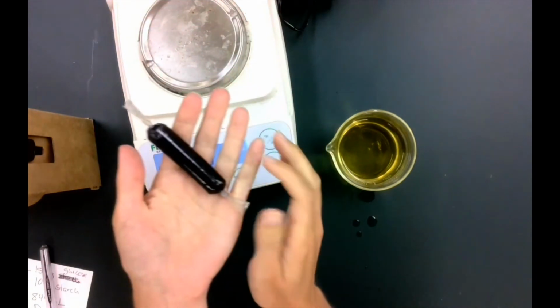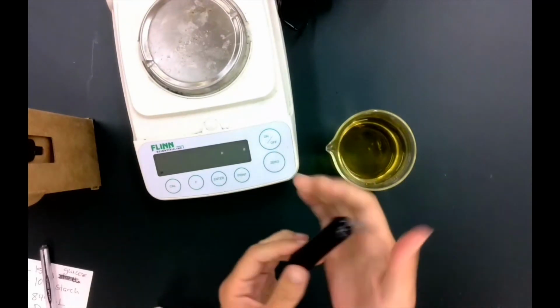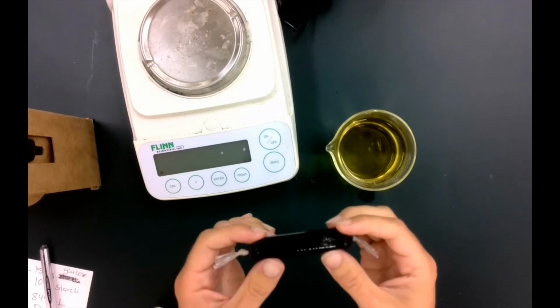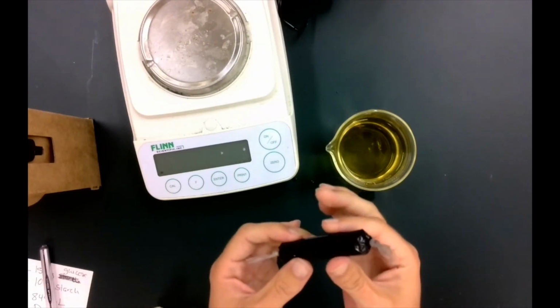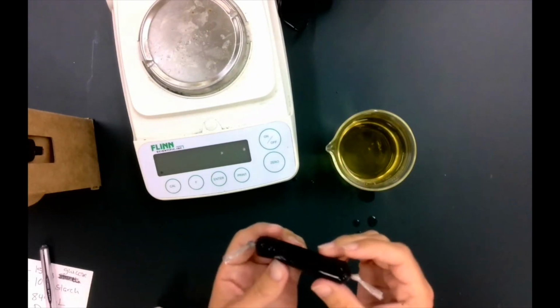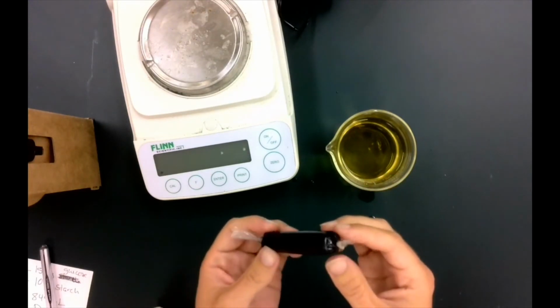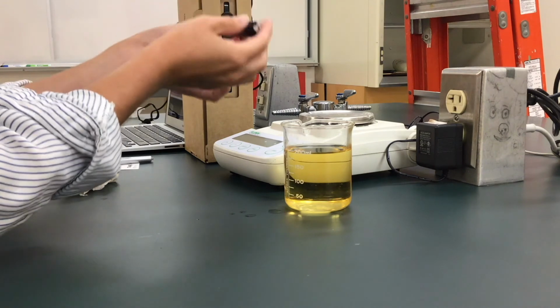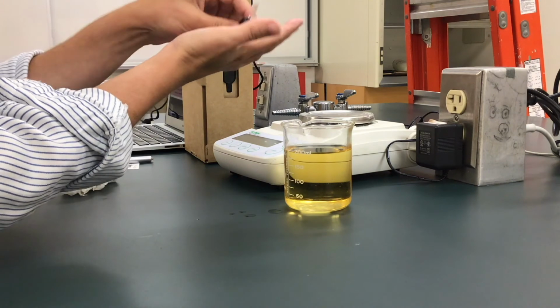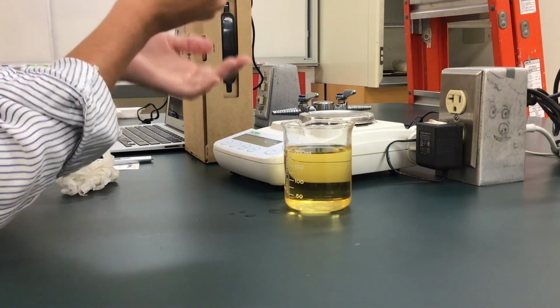and that's unsurprising to me because of the change in the bag. Now, what is the other important thing that we notice here? We have greatly increased the volume of the bag, so it's more turgid, and we have changed the color. Remember, our initial color was almost whitish, and now we see blue. And what did we say was a possible blue indicator in this? The Lugol solution. And so that means the Lugol solution has somehow entered the dialysis tubing bag and interacted with the starch material on the inside and made it blue.